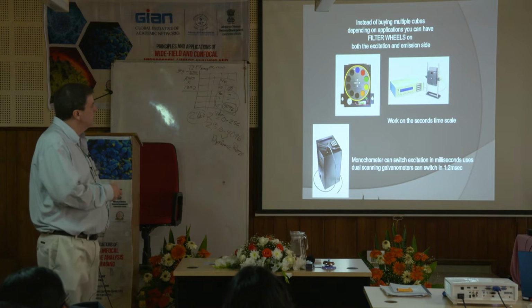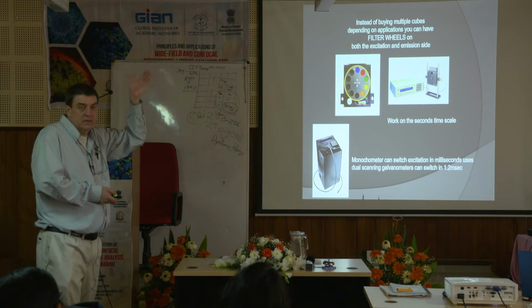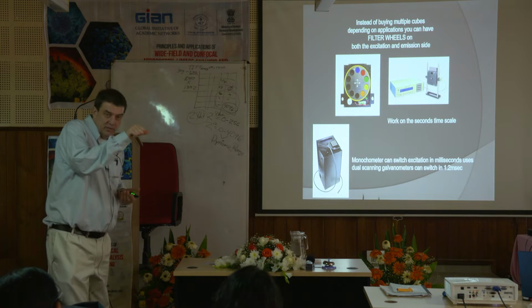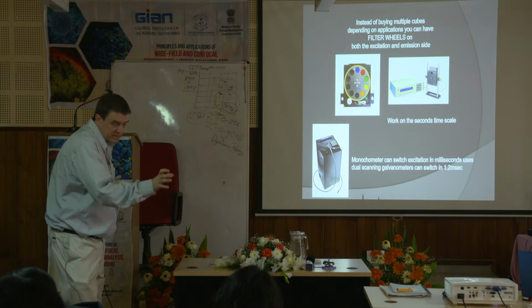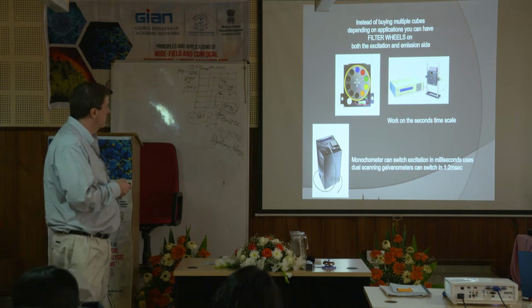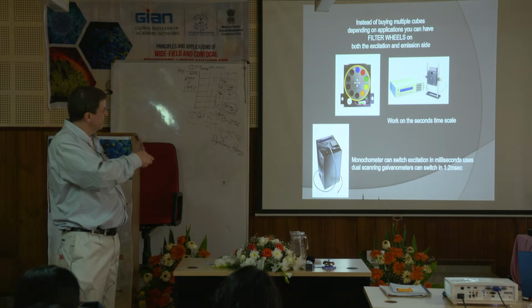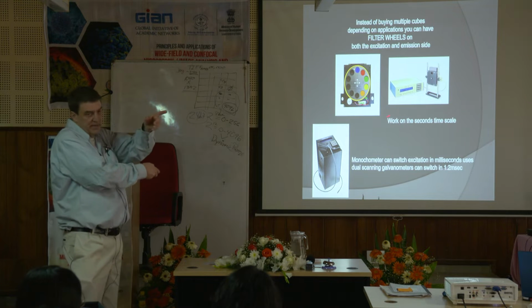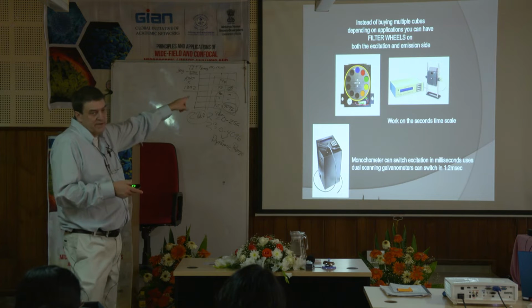Okay, so sometimes you might want to do a lot of these different excitations and emissions a little bit faster. Because like I said, that one I have, you have to physically turn the turret to pick the different cube. My microscope's automated. My cubes switch into place automatically. But if you want to go a little bit faster, they have these things called filter wheels. So what it'll do is, in the light path, this thing will spin like you program it, like a computer program, and it picks this one, and then it would pick the appropriate excitation on the other side. So in the middle of the microscope, you just have the dichroic mirrors. So you can go a little bit faster.